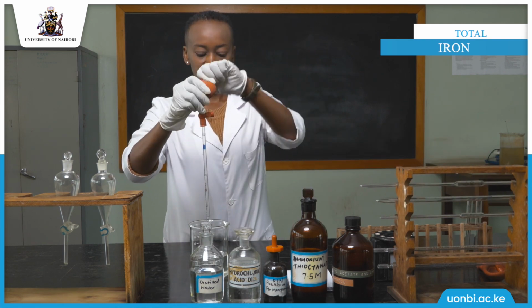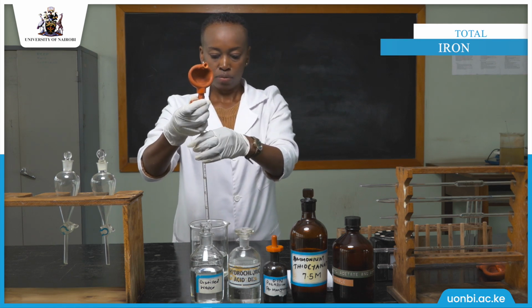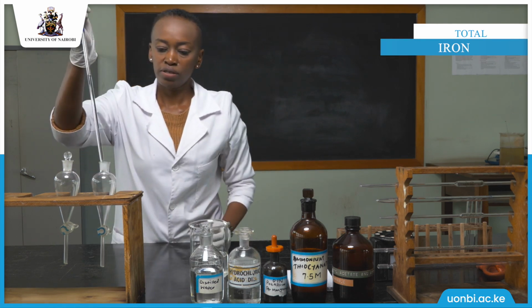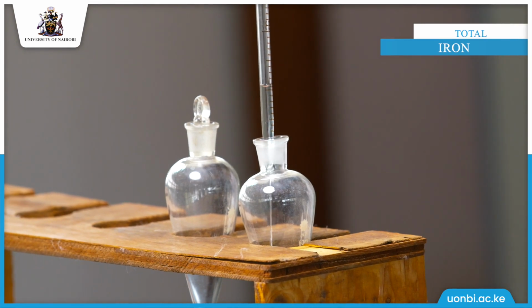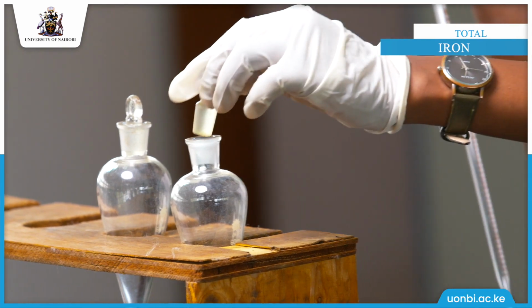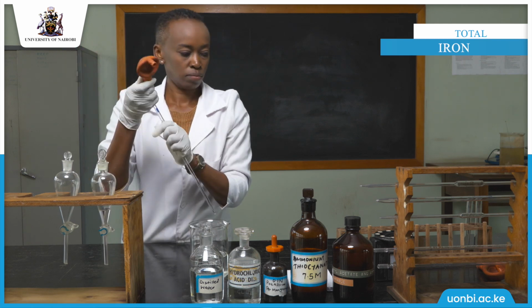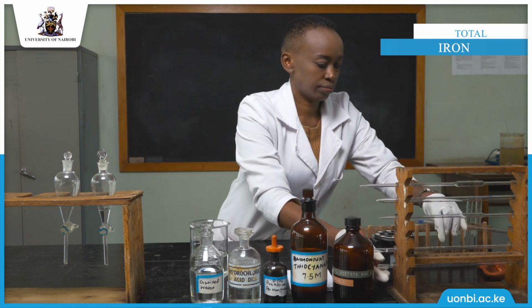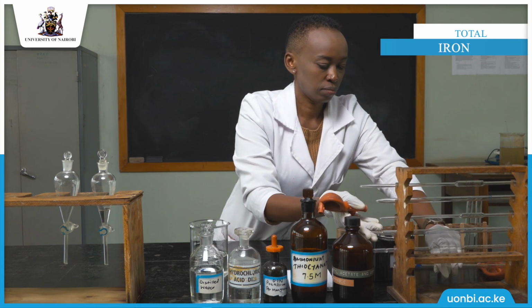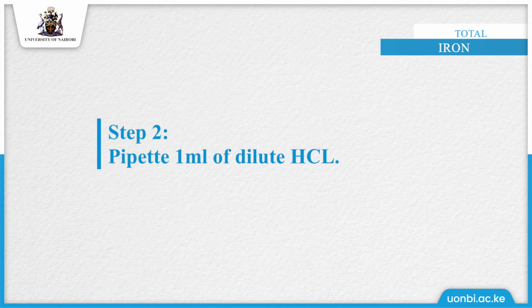So we'll take 5 ml of the sample into the separating funnel. Then we are going to take 1 ml of dilute HCl.